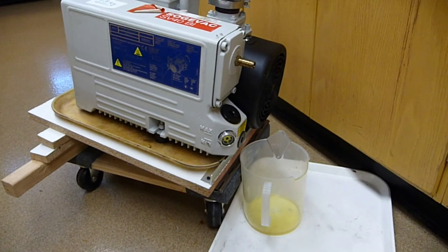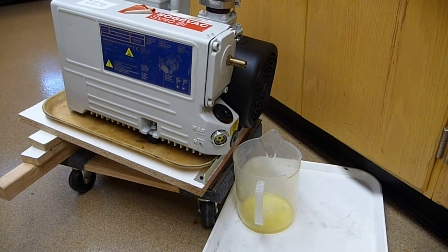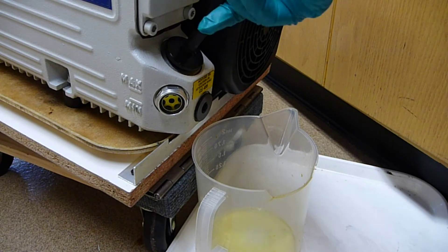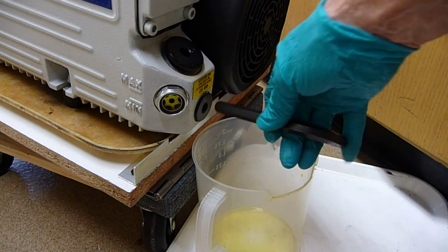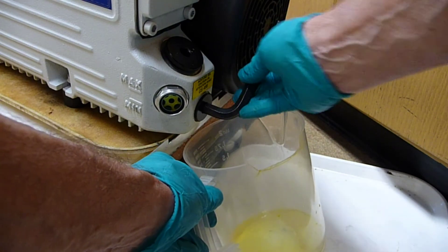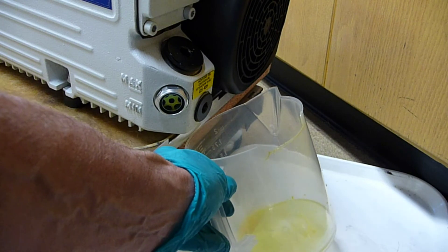Next, I'm going to let the oil drain out. This particular pump uses a 12mm hex. I loosen this top plug, and then this one I've cracked open. And now I'm going to let it squirt out.